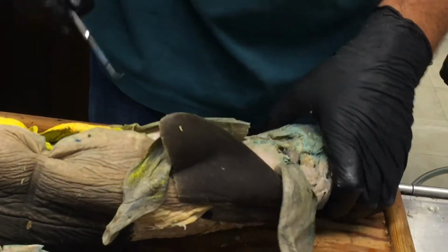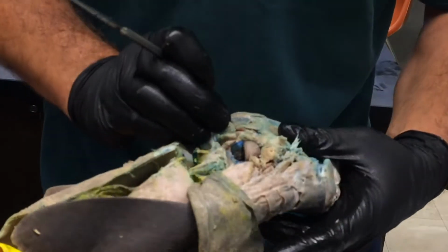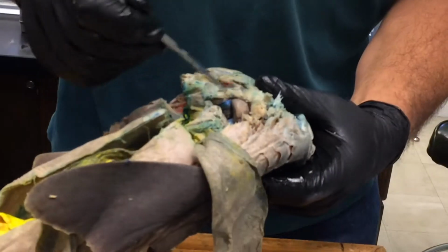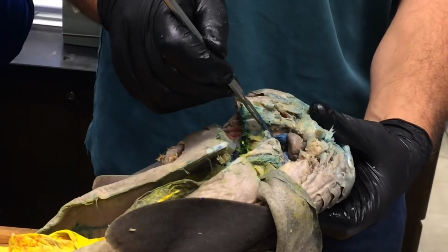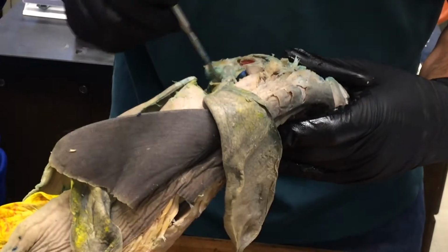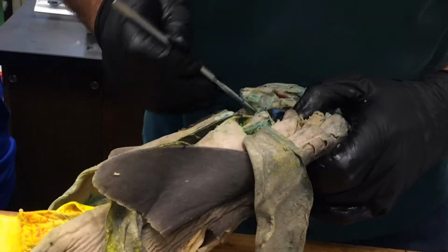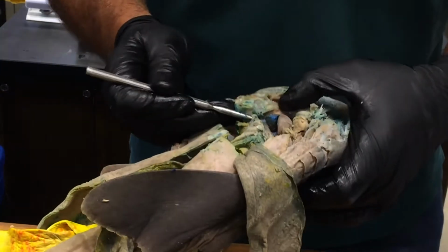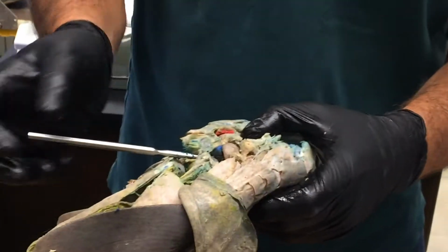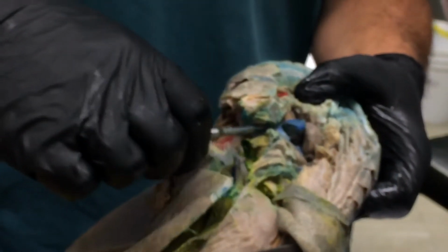The other sinus that's also best seen just by probing for it is the inferior jugular. And the inferior jugular is in the musculature just dorsal to the heart. And again, if we probe the anterior wall, if I get into the right spot here, the anterior wall of the common cardinal vein, see where the probe is going here into this musculature, right, like that?